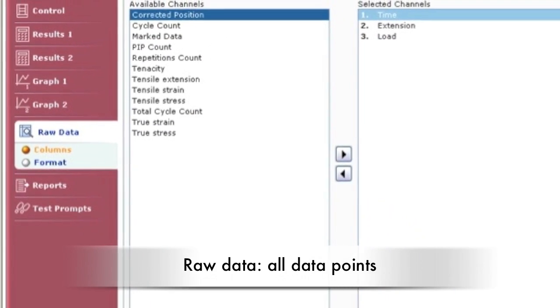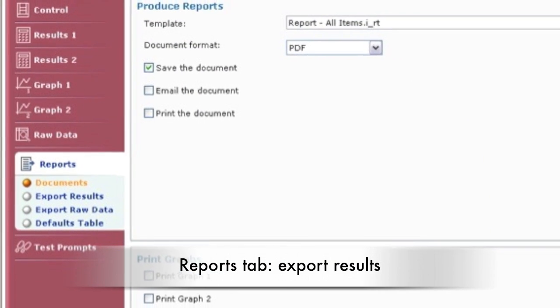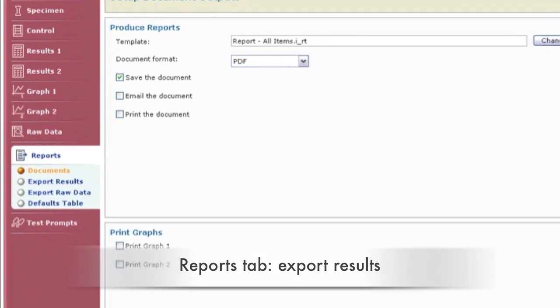The raw data tab displays all data points of the runs or tests. The report tab allows you to print or export the results to a PDF or Word document.